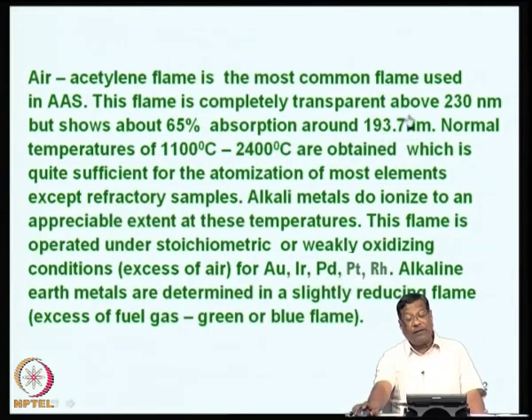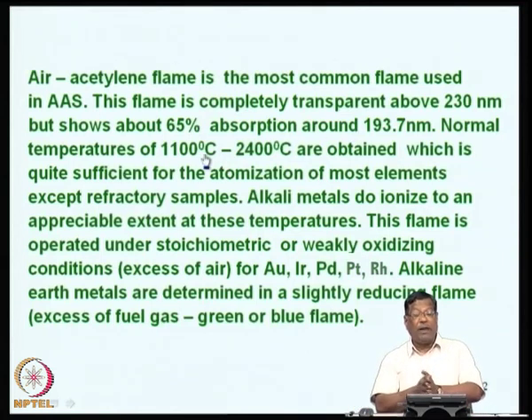This is the resonance line for arsenic. So, you cannot determine arsenic using this radiation, air acetylene flame.